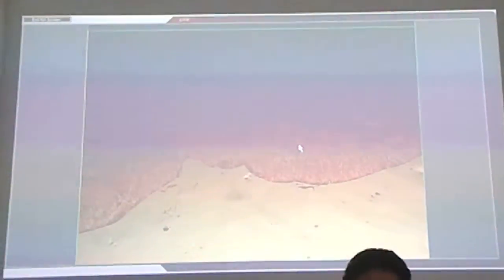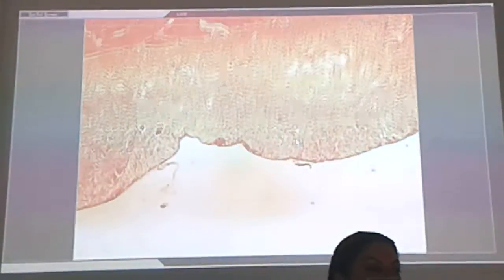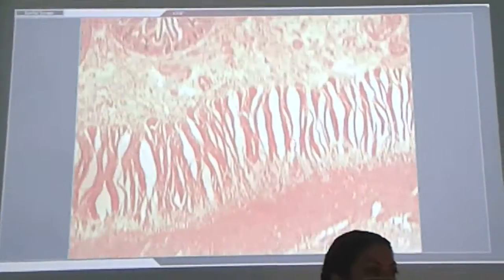Will I see Brunner's gland? Will I show you Brunner's gland? No. Why? Because it's only in the duodenum. Yeah? Alright.